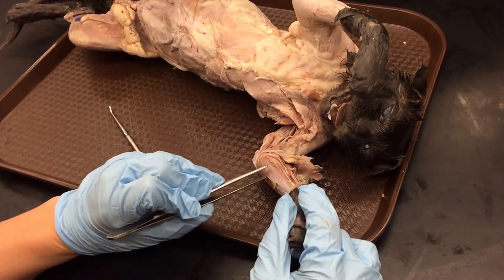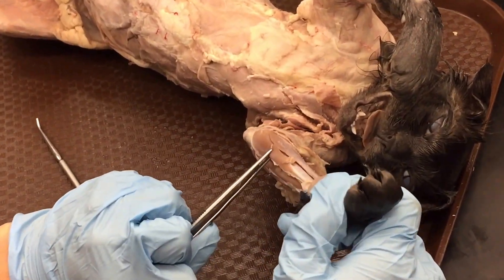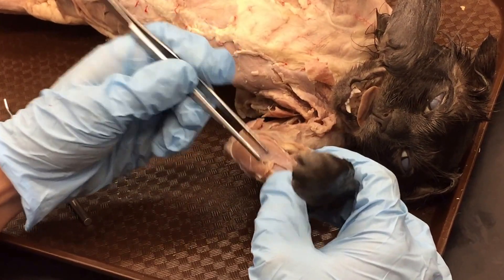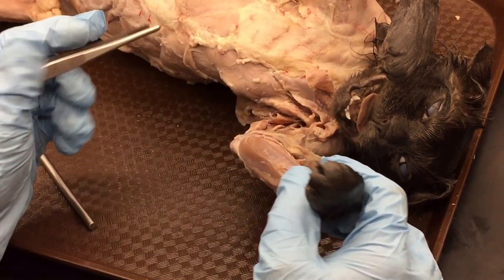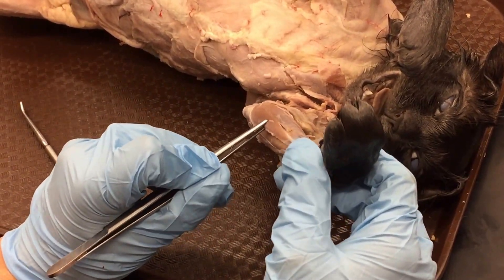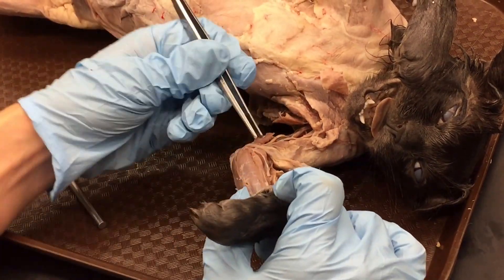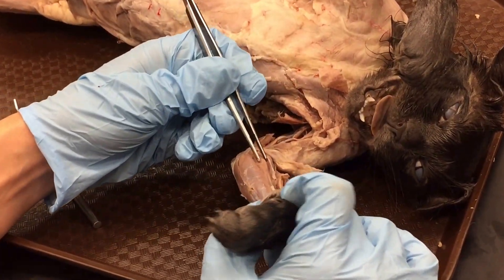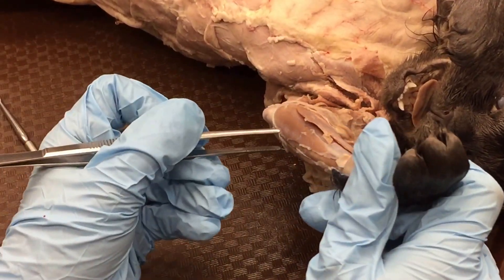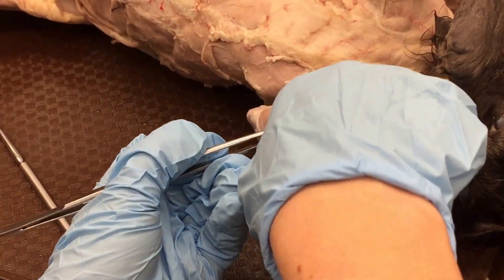Flexor carpi radialis, palmaris longus, and finally flexor carpi ulnaris — so we're just covering the superficial muscles. If they were flush, it would be palmaris longus and then the other big one is the flexor carpi ulnaris. So those are the four on the flexor side: pronator teres, flexor carpi radialis, palmaris longus, and flexor carpi ulnaris.